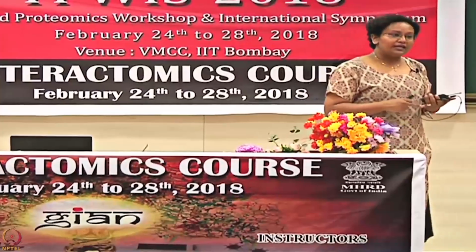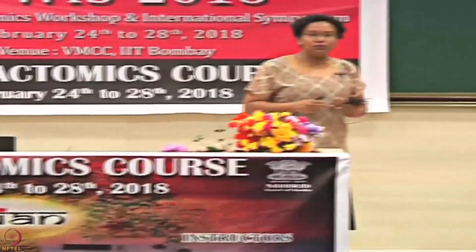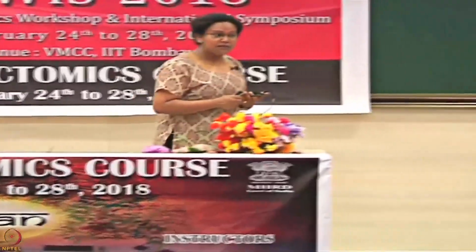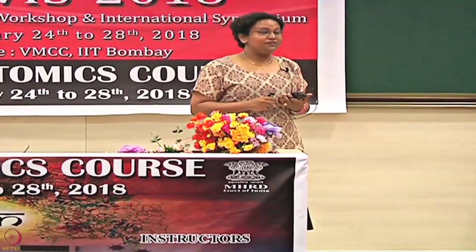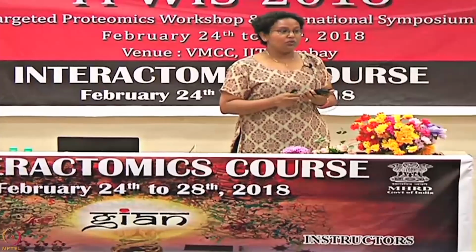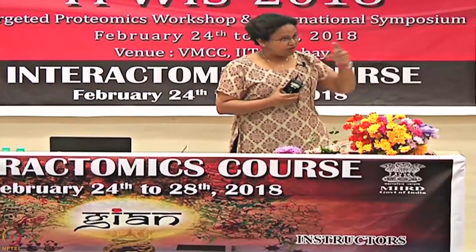If you are doing a kinetic analysis, even 100 RUs is quite high sometimes. Sometimes you have to go as low as 50, 20, or T200 actually allows you to work as low as 5 RUs R max.